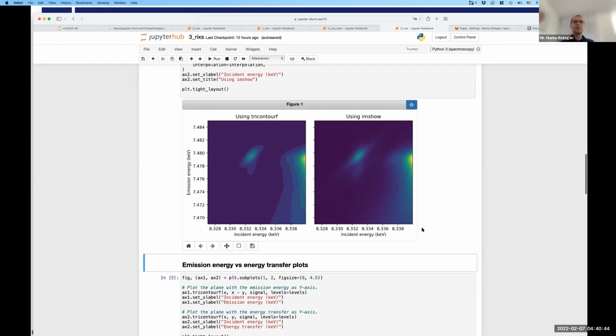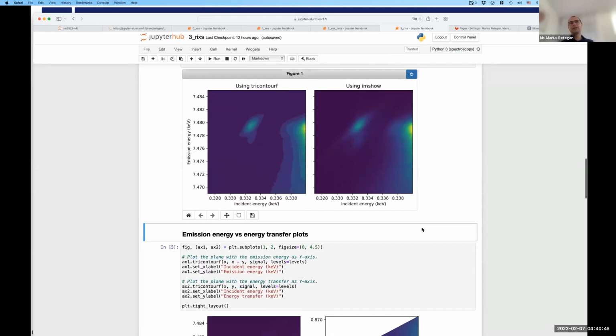This is something to keep in mind in general when you're plotting data, and the fact that you are seeing all these options. I know it can be intimidating, because we go back to the discussion that there are a lot of options and a lot of things you need to take into account. But if someone else is doing this in a graphical user interface, you actually don't know what's happening. So at least the advantage here is that you see, and if you read a little bit of the documentation, you can understand what's happening behind the scenes.